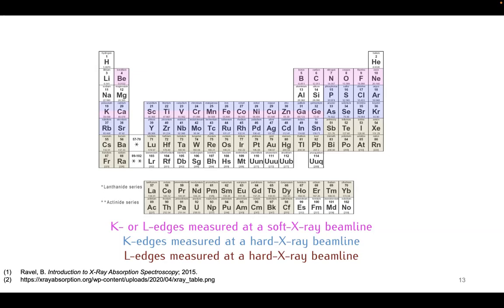Okay, so in terms of then tuning chemical specificity, if you have elements within your material that you want to isolate, what you would want to do is pick the energy, right? So if you have something like NMC, you have lithium, nickel, manganese, cobalt, and oxygen. Typically, you can't probe all of those species at the same beam line because the K edges for the transition metals, those energy levels are much higher than that of your lithium and that of your oxygen.